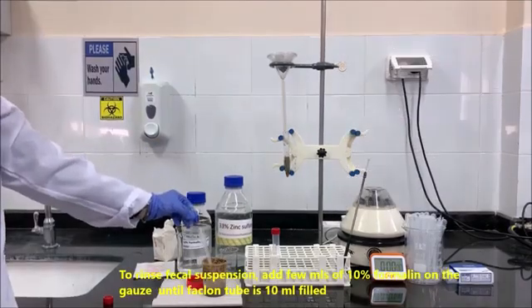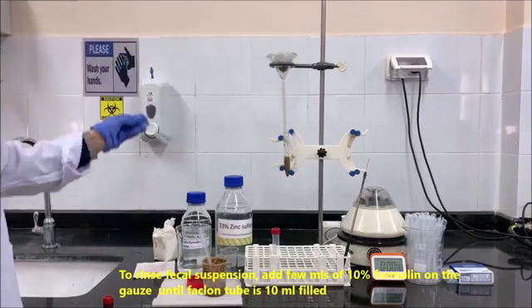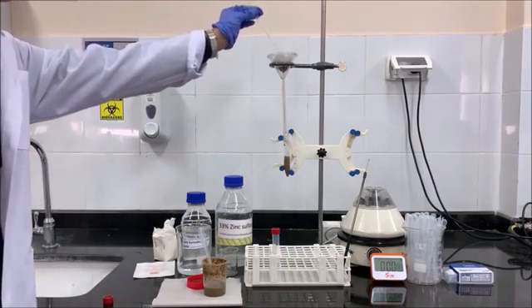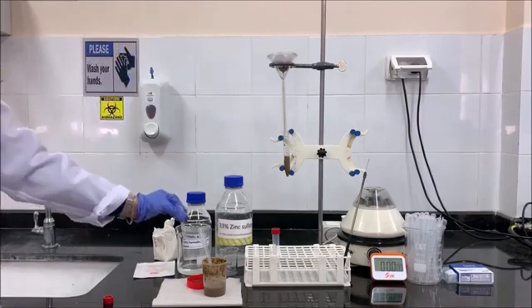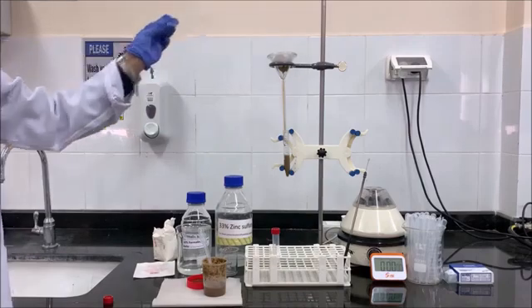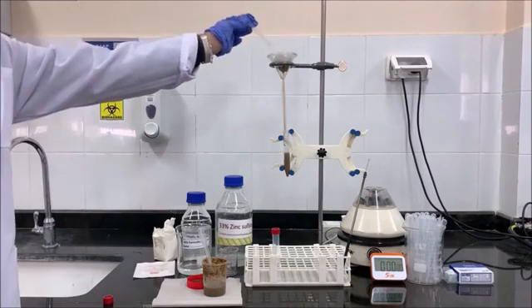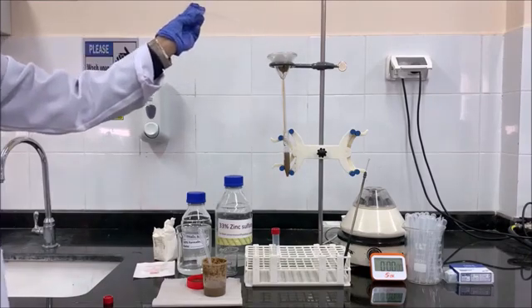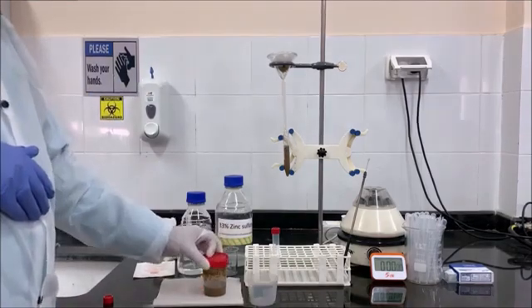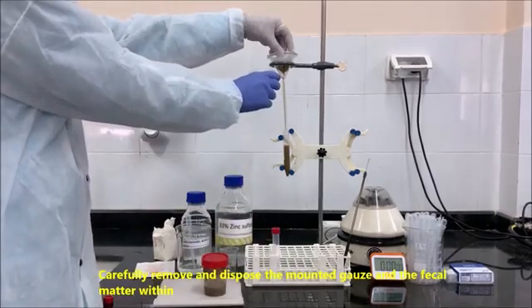To rinse the fecal suspension, add a few mLs of 10% formalin on the gauze until the Falcon tube is filled to 10 ml. Carefully remove and dispose of the mounted gauze and the fecal matter within.